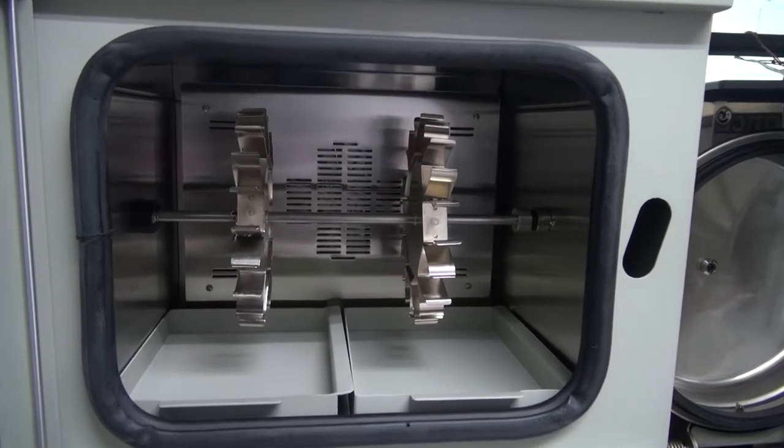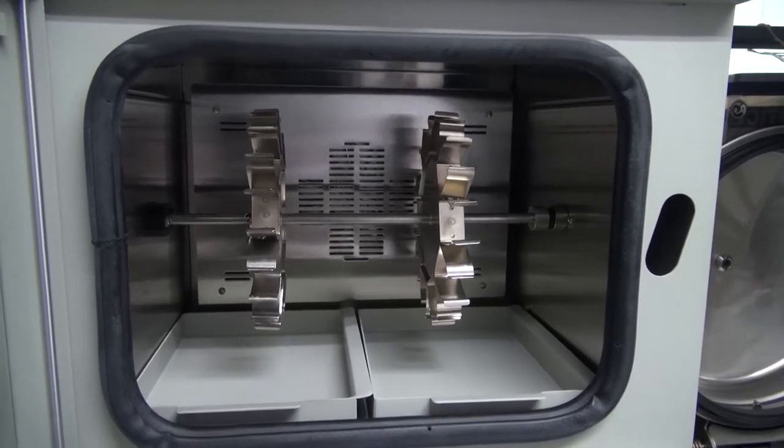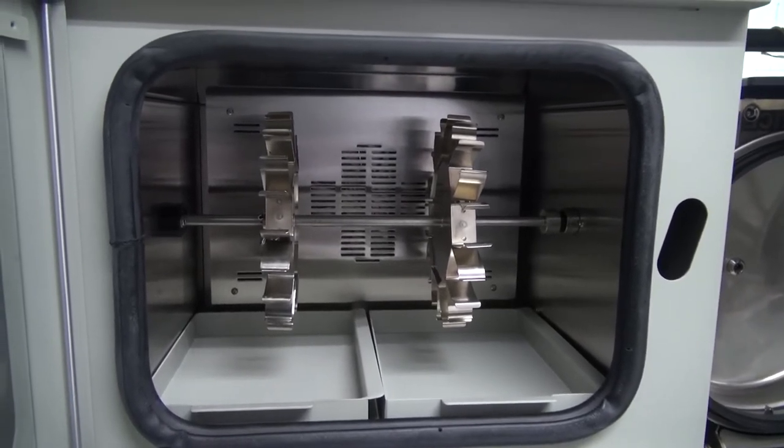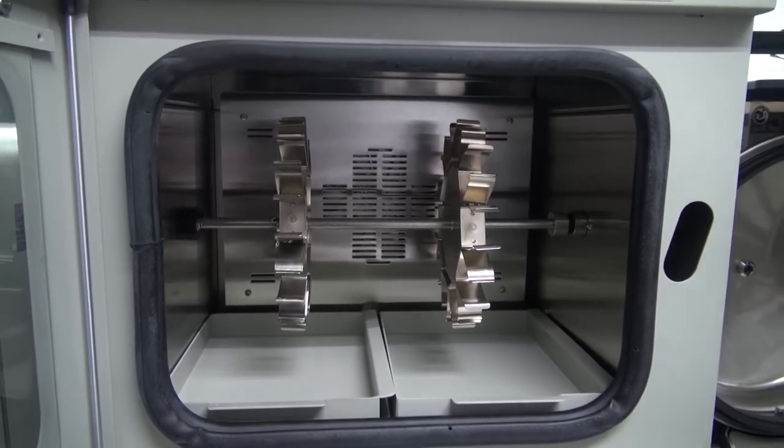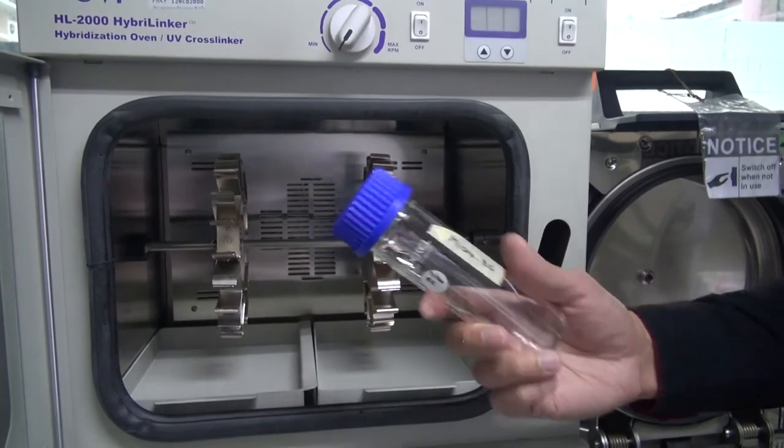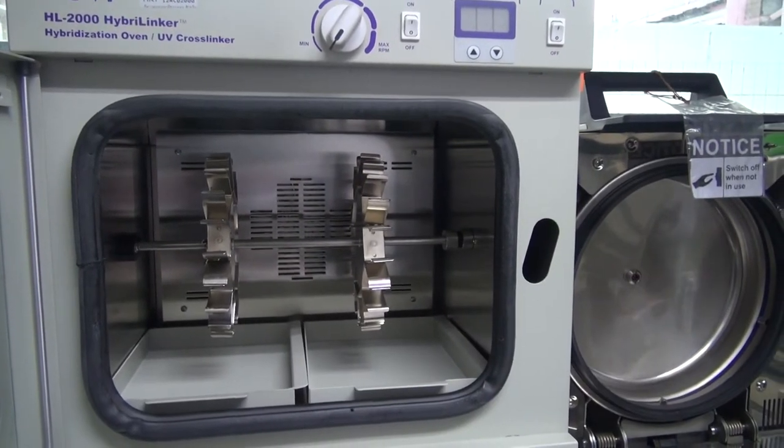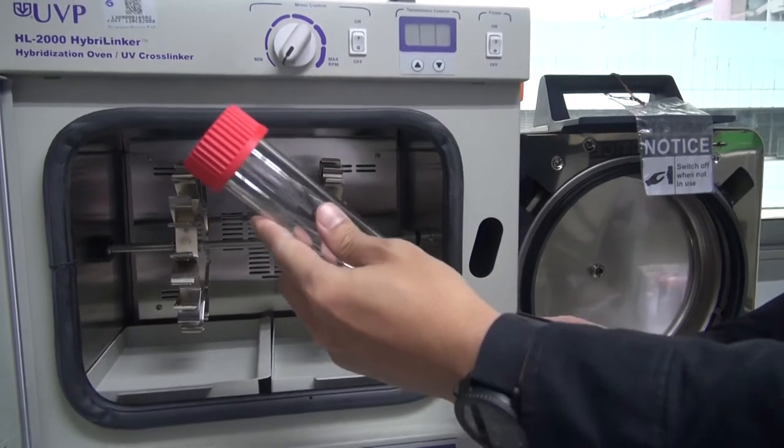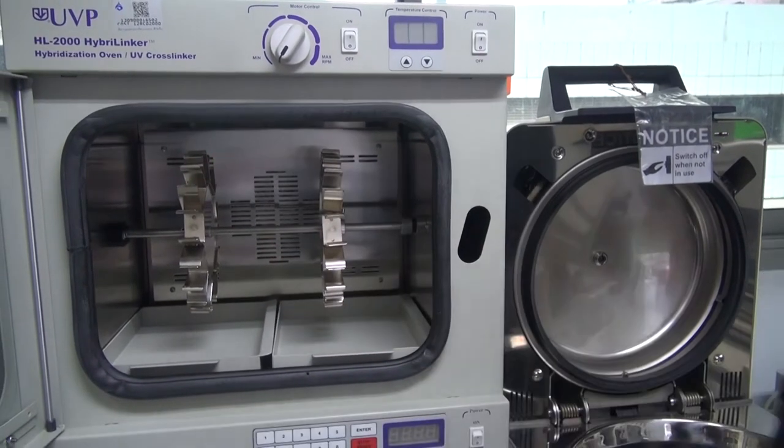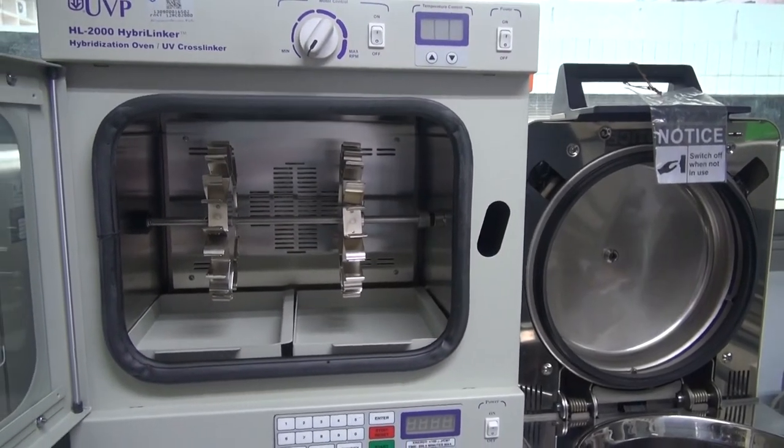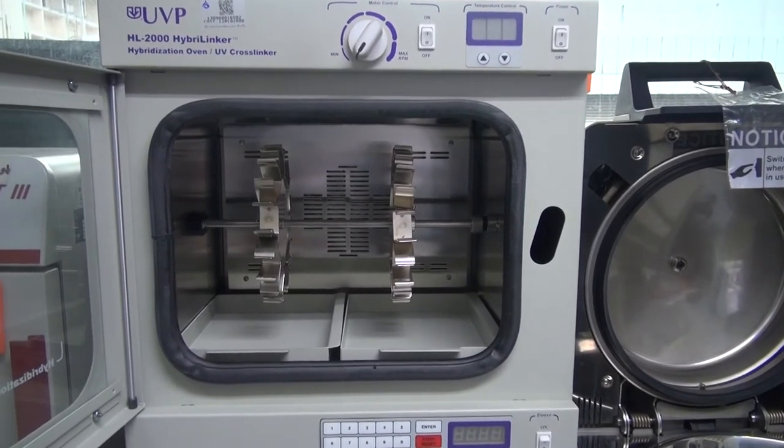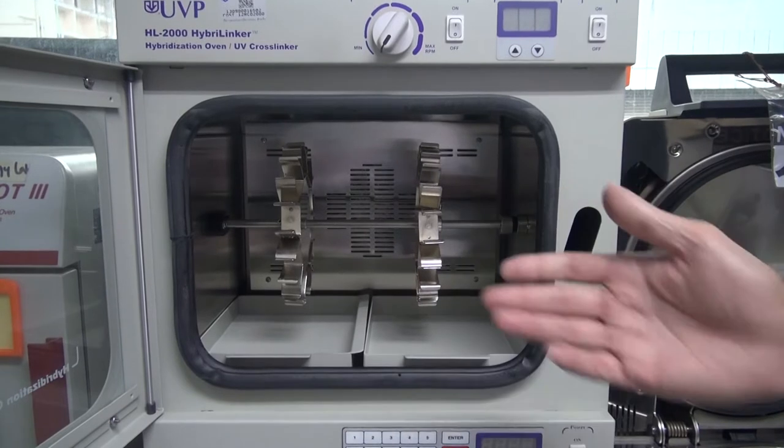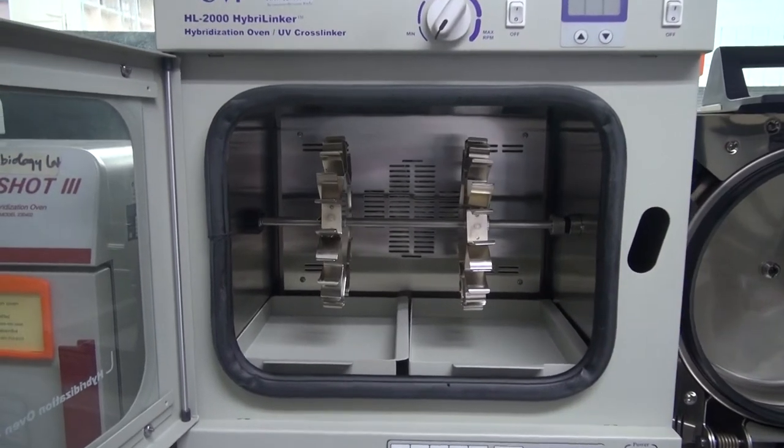There are two hybridizer bottles of different sizes available for containing samples needed for hybridization, which are 150 millimeter and 300 millimeter long bottles. From now on, I will call them short and long bottles. The rotary carousel wheel can hold up to 20 short bottles and 10 long bottles.